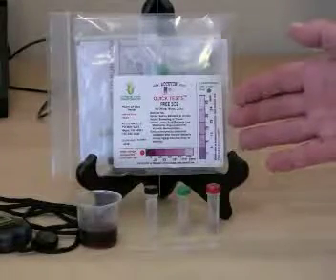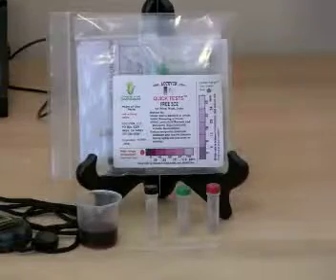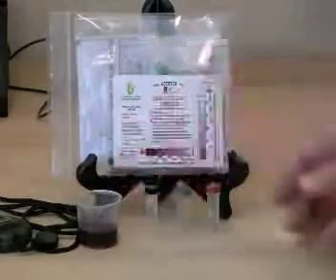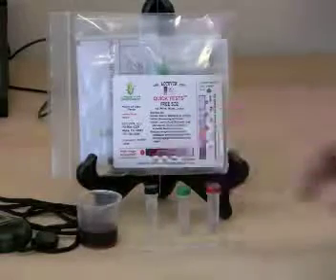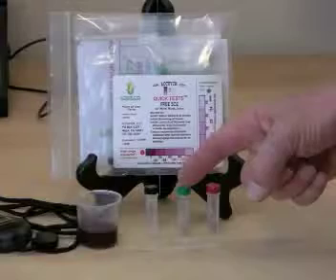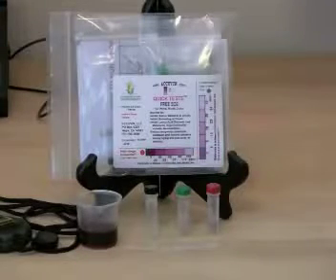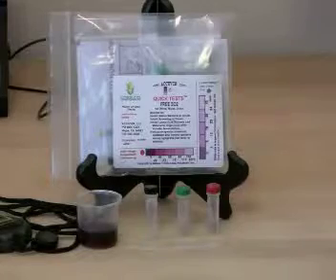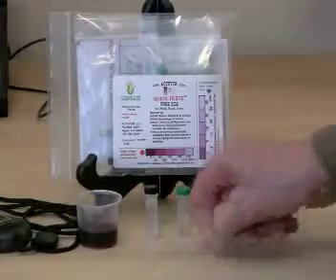This is an Acuvin free SO2 test kit. To run a free SO2 test, you'll need a wine sample, a diluent tube with a black cap, a tube with a green cap if you think your SO2 level is low, or a tube with a red cap if you think your SO2 level is high, and the sampler.